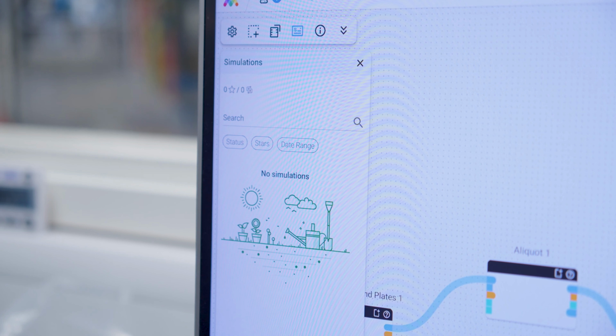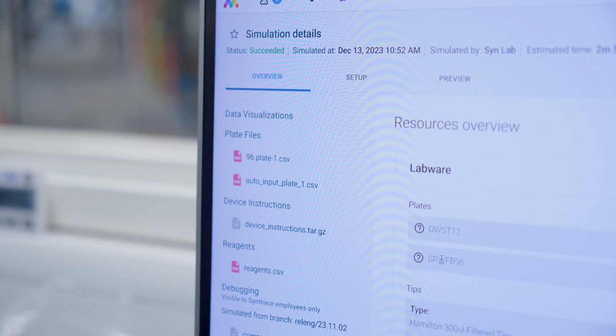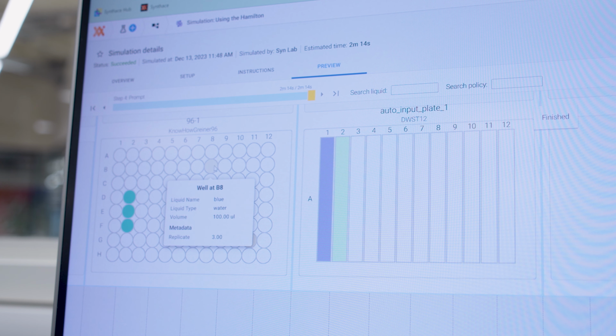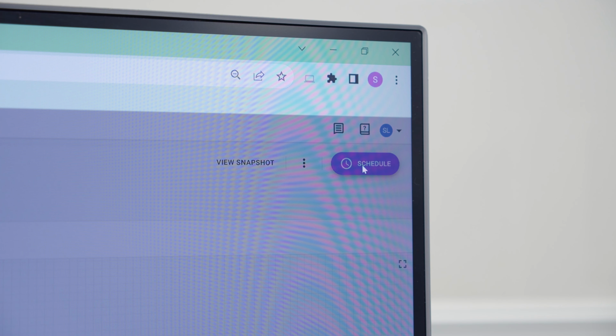Then click Simulate. Synthace will digest the information from your workflow and generate instructions for your Hamilton, shown in the Preview tab. So now let's send that information to the Hamilton by clicking Schedule.